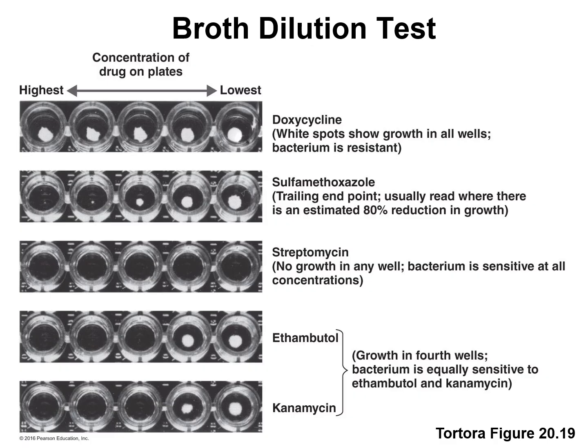If you take a look at these different antibiotics, the lower the MIC means you're going to have a more effective antibiotic. So if you look here, the antibiotic with the lowest MIC, the one that's going to be the most effective and do the best job, would be streptomycin.